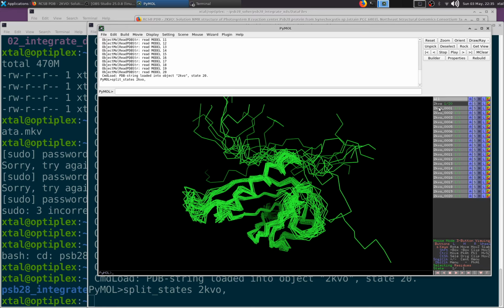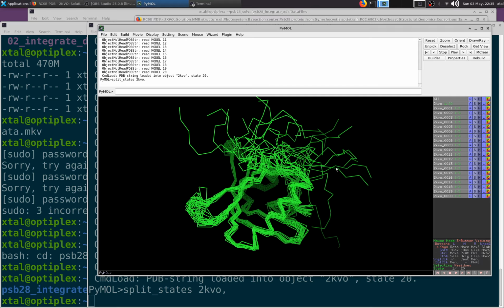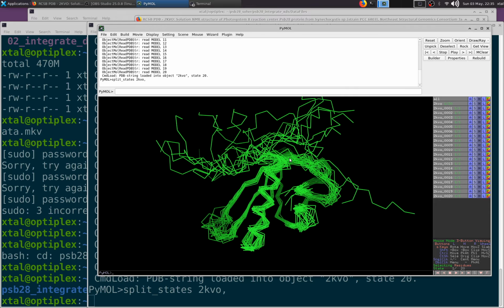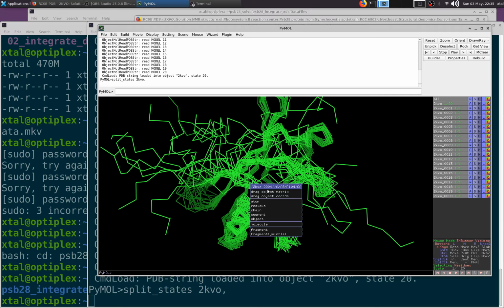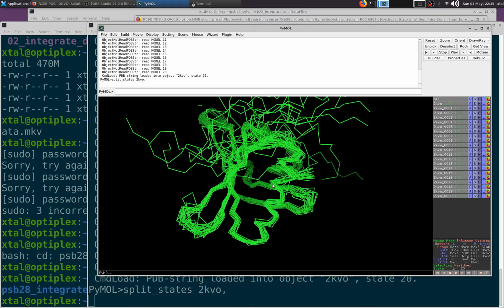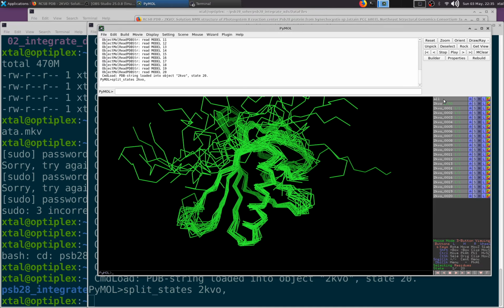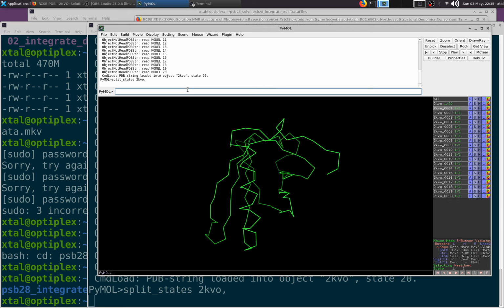So if we just look at one of them, hang on, let's look at all of them again, and just look at where the last good bit is at the C terminus. There, that's 104, and then after that is no good. Also, this bit's quite variable too, but we'll leave that. Okay, so we'll take model 1 and we'll select our model.